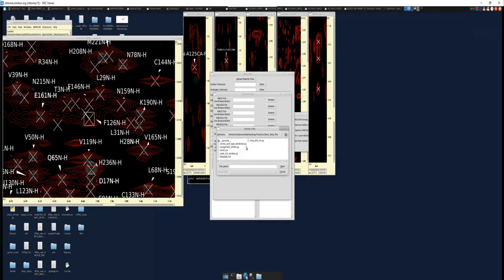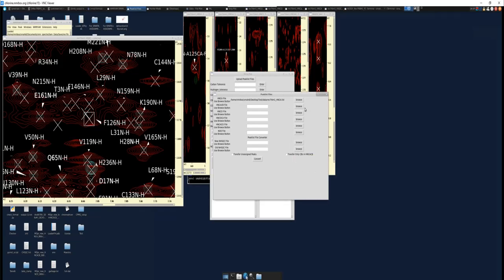So all you do is upload your peak lists. Let's go to the data, and we have our peak list here, the HNCACB. We have an HNCA, we have an HNCACB. I won't upload HNCO and HNCOCAs for time's sake, but they work in the same fashion. You can also upload HNCOCA, and we'll do the NOSY. We'll keep it simple. Where is the NOSY peak list? Oh, here it is.